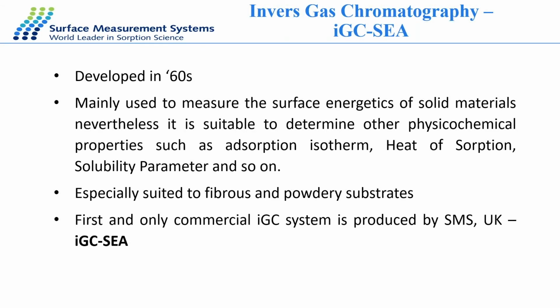IGC technique was developed in the 60s. It's mainly used to measure surface energetics of solid materials. Nevertheless, it's suitable to determine other physical-chemical properties of solid materials, such as adsorption isotherm, heat of adsorption, solubility parameter, and so on.